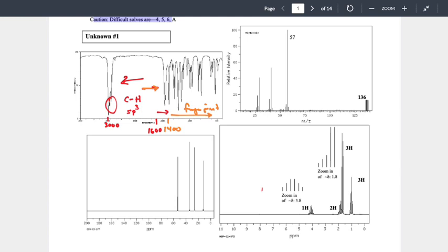Or is that actually a triple bond? Getting really subtle changes in that structure, all of those things can happen in that range, and I want to avoid putting analysis in there, because the instant I write down that analysis, I'm now in the mindset of that must be true, and that isn't always the case. Kind of makes sense?